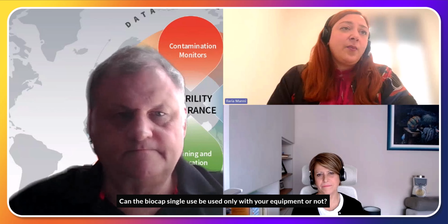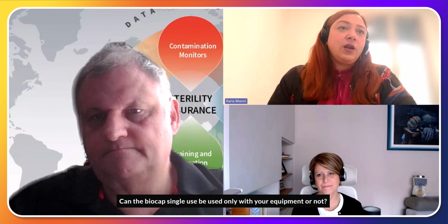And I'd like to move on to the last question for today. And Julia, this is for you. Can the BioCap single use be used only with your equipment or not?